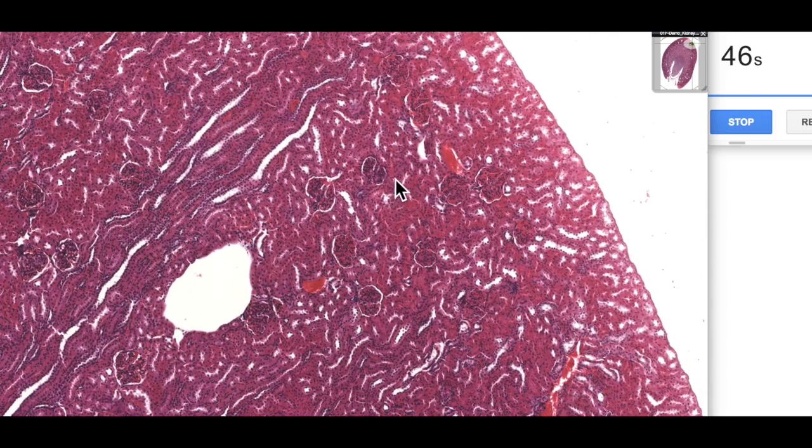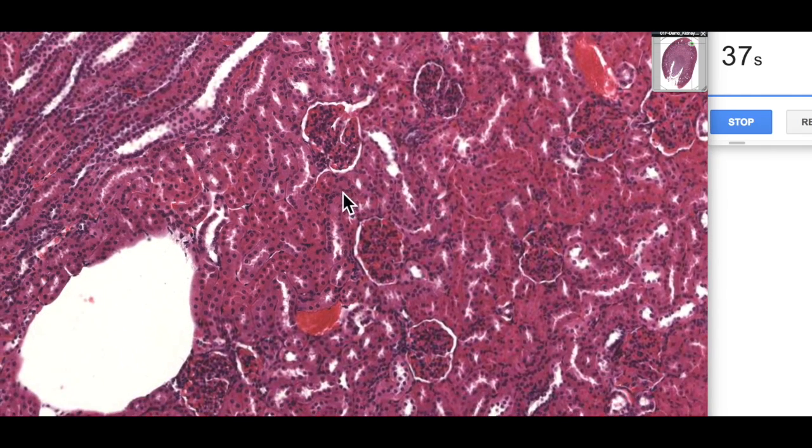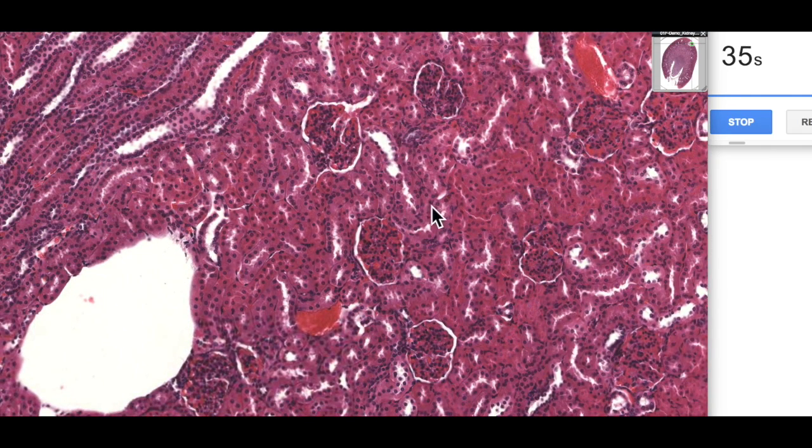If we have a look at a little bit more finer detail we've got the renal corpuscles here. We can see these and then all of here are the renal tubules made up largely of proximal convoluted tubules and then also some distal convoluted tubules.